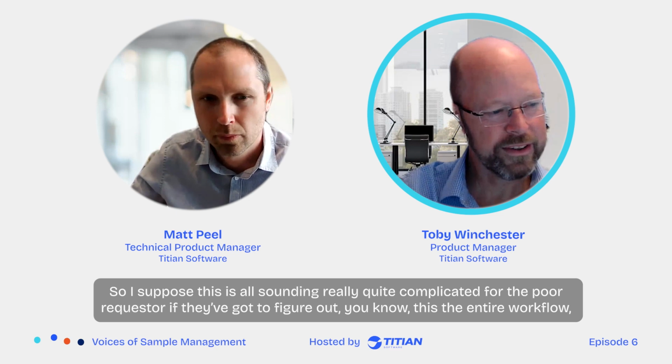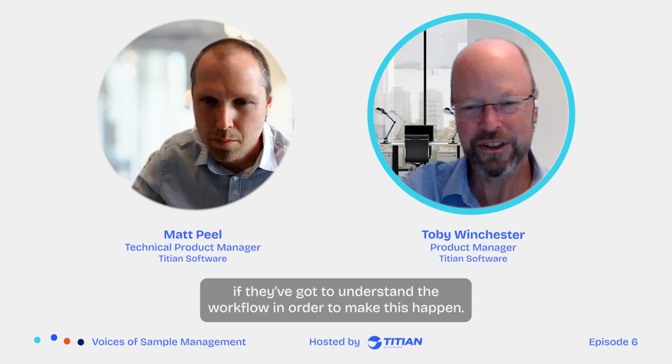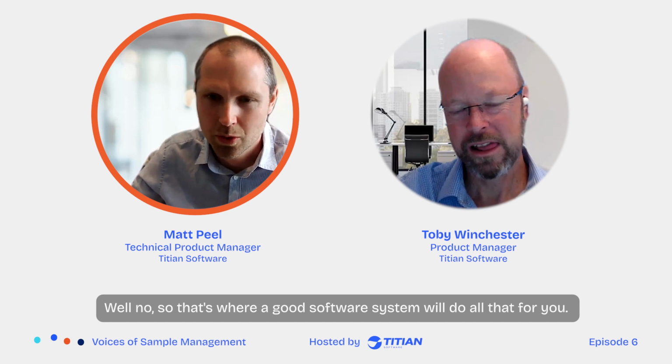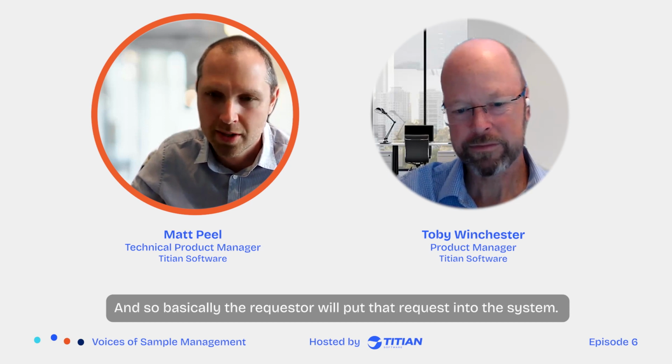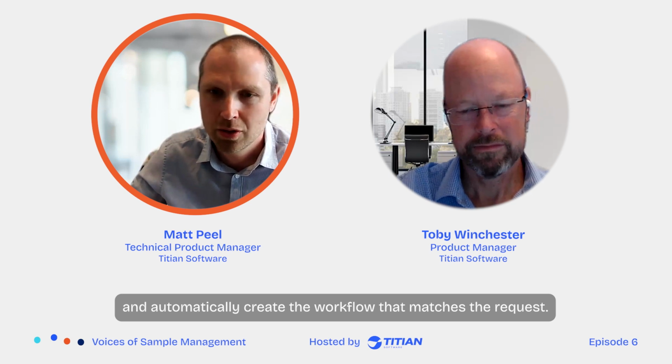So I suppose this is all sounding really quite complicated for the poor requester. Have they got to understand the workflow in order to make this happen? Well, no. That's where a good software system will do all that for you. Basically, the requester will put their request into the system. The system will know what workflows are possible and what steps are needed, and automatically create the workflow that matches the request.